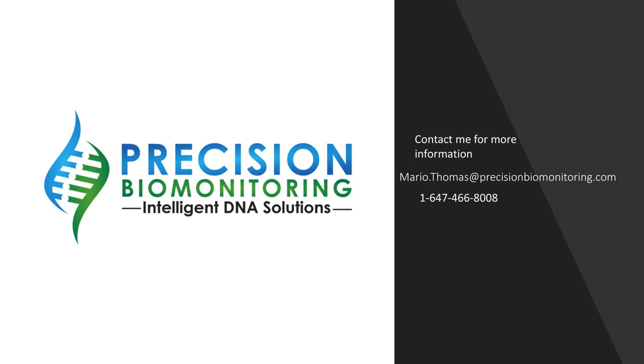Another thing to consider is that I spoke before about the nanopore platform, and I think it's a very promising avenue for on-site sequencing. So, for example, if you have projects that you think are better sequenced directly in your environment, nanopores should be a solution to consider, because they are really improving their sensitivity and reducing the error rates. Just in the past few months, it was incredible how they improved the service. You will need some skills for the nanopore, but it's very easy to use for, I mean, every scientist.